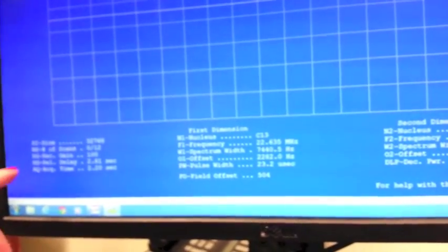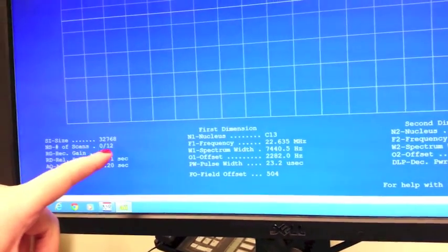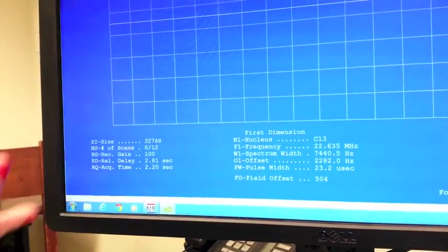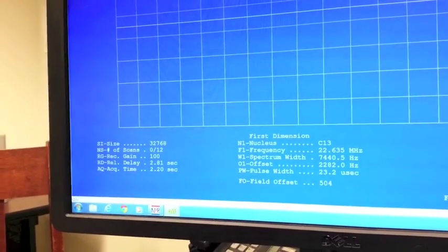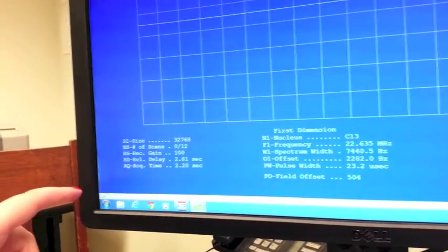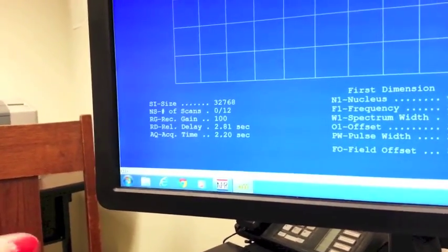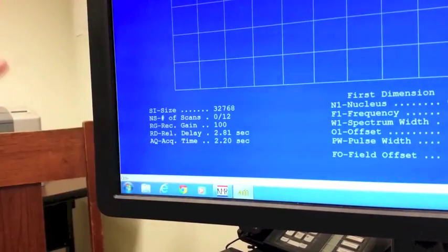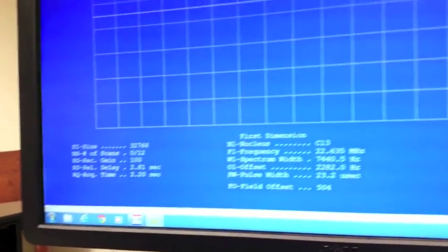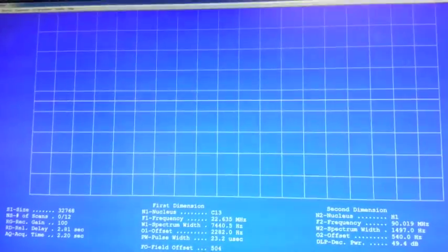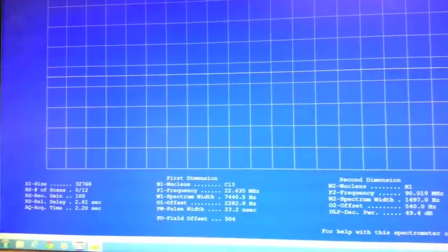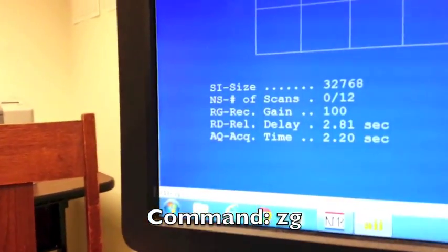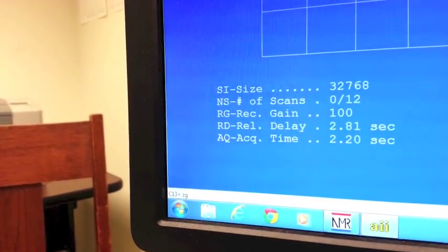After that, you want to check the number of scans. It will automatically come up with 12 scans, which should be good for our sample. The last thing you want to check is the receiver gain. For C13, you always want the receiver gain to be 100, which it is right now. The last thing you want to do is actually take your scan. To do that, you want to type in ZG and hit enter.